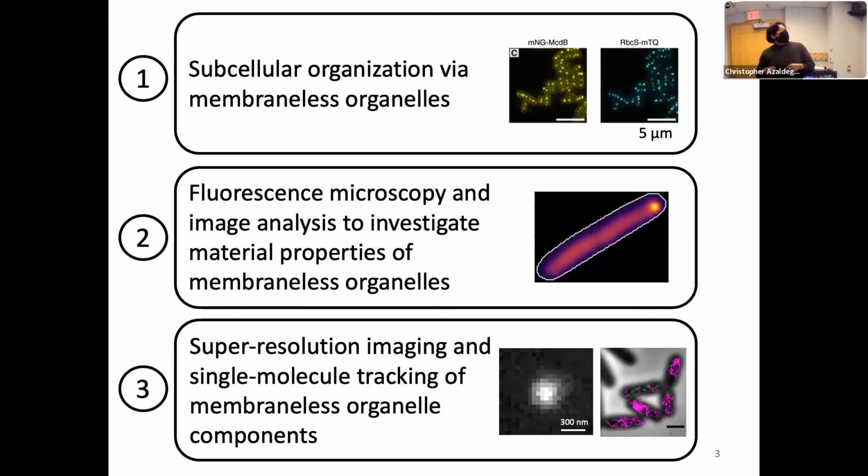So here, I want to outline my talk in three individual sections. First, I want to motivate it through the biology that I'm particularly excited by, understanding subcellular organization via these membraneless organelles. And then next, I'll talk about the work that I'm doing in collaboration with the bacterial lab, doing single cell imaging, applying fluorescence microscopy, as well as my portion doing image analysis to investigate material properties of these membraneless organelles. And finally, get into using super resolution imaging as well as single molecule tracking to study the components inside of these organelles and measure their dynamics.